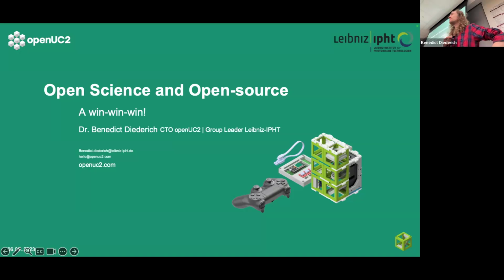So today I wanted to give you a brief introduction into optics again. What we're doing is modular optics, and to my surprise and to your surprise as well, I have even something in my backpack. I was in Woods Hole, near Boston, and I gave a lecture for biologists in marine biology. They, of course, use microscopes, but they don't really know how to build them, and that's what we're trying to solve. Microscopes are sometimes very complex, but for me they're not. What we build is the Lego for optics in a way, and it's all open source.